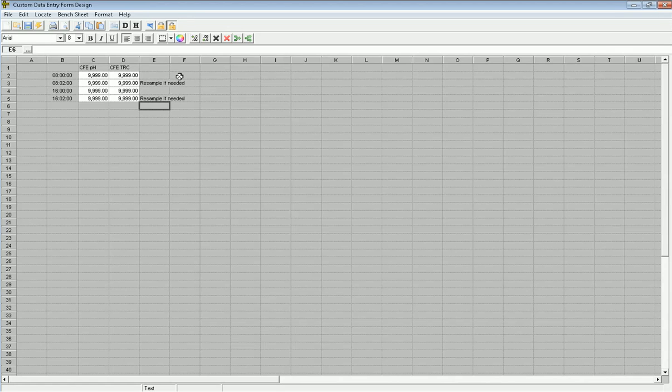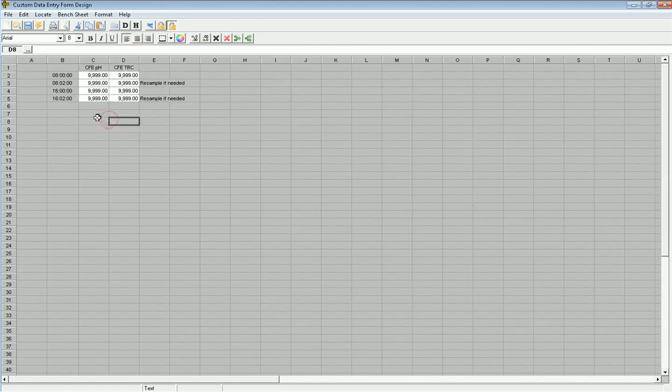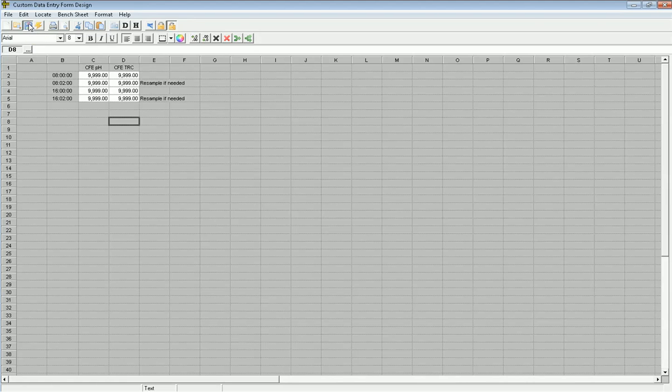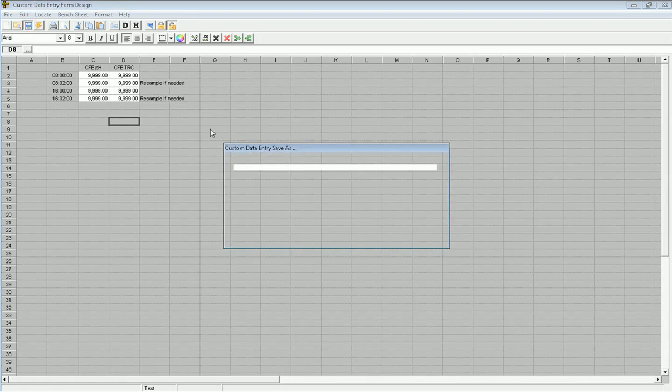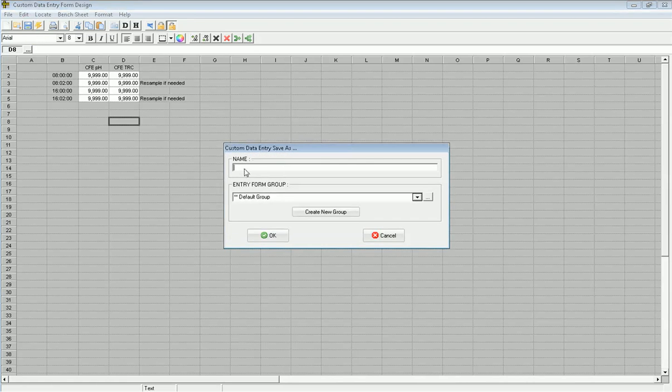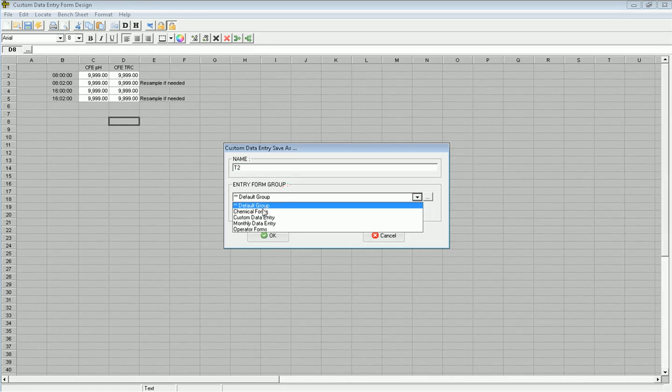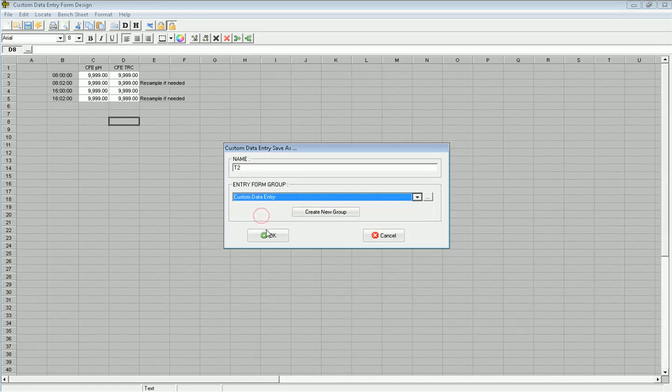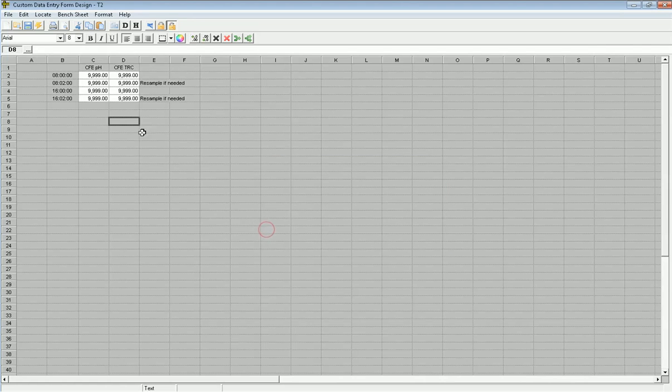So now I've designed what I would consider a very ugly form, but it's going to illustrate what we want to do. I would want to probably make this a little prettier, draw some borders, move it around, label stuff a.m. and p.m. sample. But in this case, we're just illustrating how this minutely data entry can work. So I'm going to go ahead and save this, and I'm going to give it a name of T2. I'm going to store it in custom data entry. Go ahead and click OK.